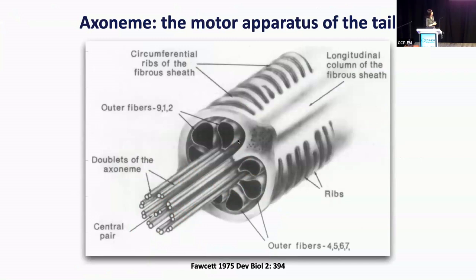And so, to go about trying to identify the proteins that are in this assembly, we had to be more creative, but the first idea came from something we tried to avoid for a long time. I like this because it's one of our first EM sessions on the pig sperm, and it's made of these high magnification projection images. And if I zoom in only on the end piece that you can see here, what happened is that we lost the membrane, and then you see the microtubules are actually spreading a bit out.